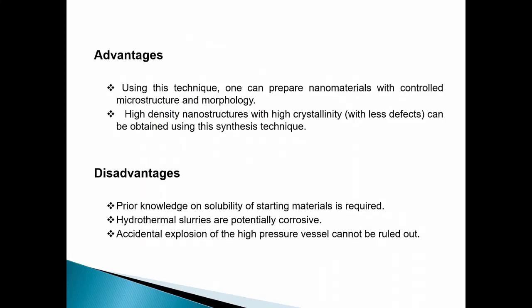The hydrothermal method has some advantages. They are: using this technique, one can prepare nanomaterials with controlled microstructure and morphology. High-density nanostructures with a high crystallinity can be obtained using this synthesis technique.